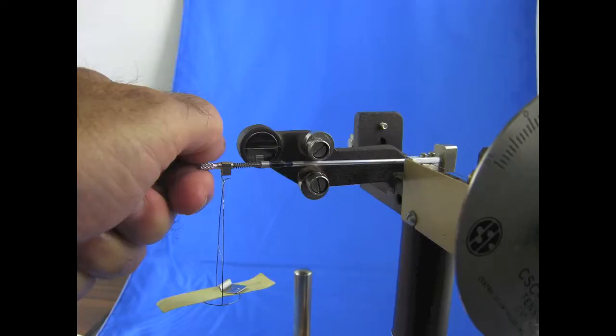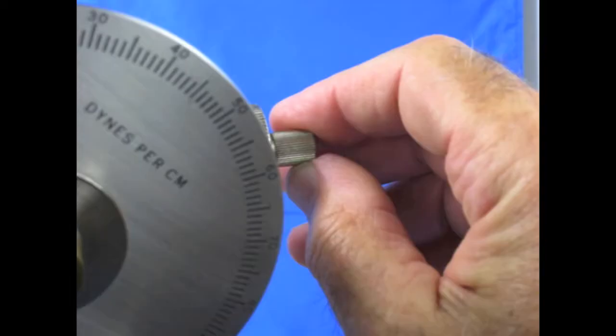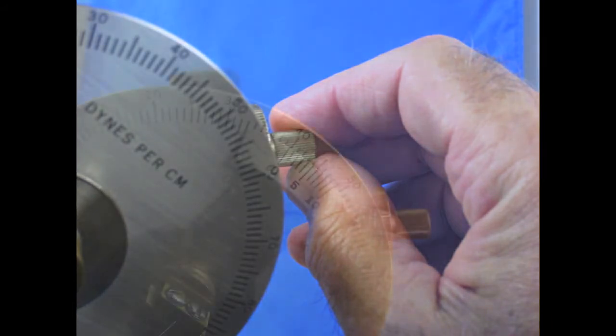If the calculated number is greater than the dial reading, use the torsion arm adjustment nut and turn it counterclockwise. If the calculated number is lower than the dial reading, turn the adjustment nut clockwise. One full rotation is about three dynes per centimeter. Repeat this until you can bring the pointer to the line using the adjustment knob, and the dial vernier reading is within 0.5 dynes of the calculated number.